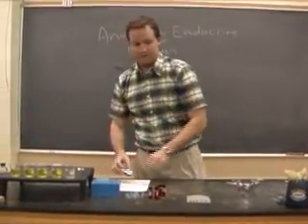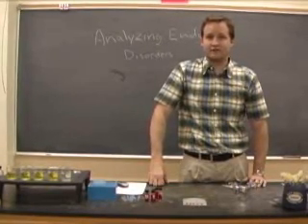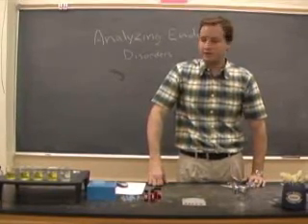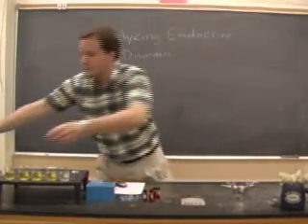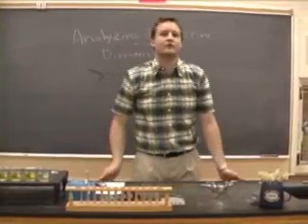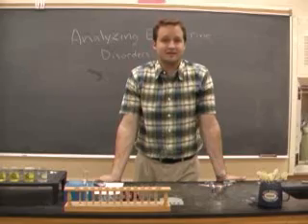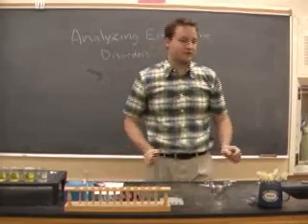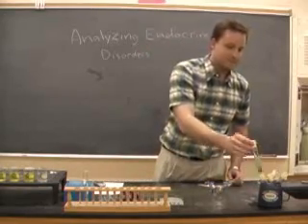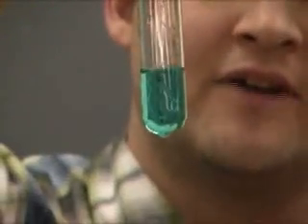All right. The only thing we have left to do is to check our results for the Benedict's test, which tested, of course, for the presence of glucose. So let's take these out one at a time, and we'll put the samples in the test tube rack. Again, what we're looking for is a cloudy appearance. What we're looking for is the formation of a precipitate, which indicates the presence of glucose. So let's find test tube A. What you're looking for is a cloudy color. Cloudy, almost white. And that, to me, looks like a negative test.